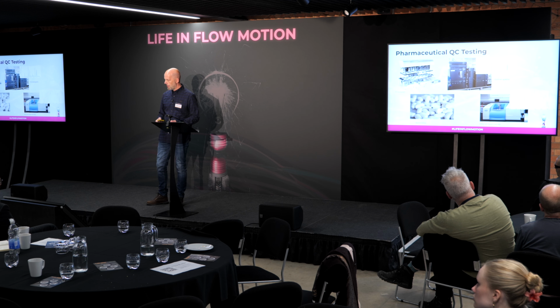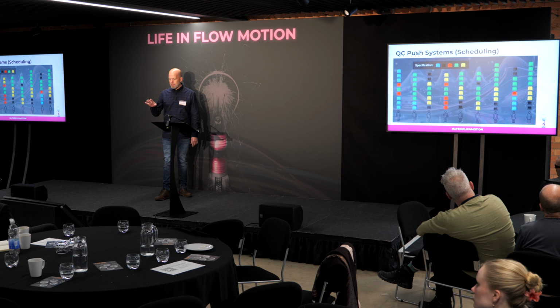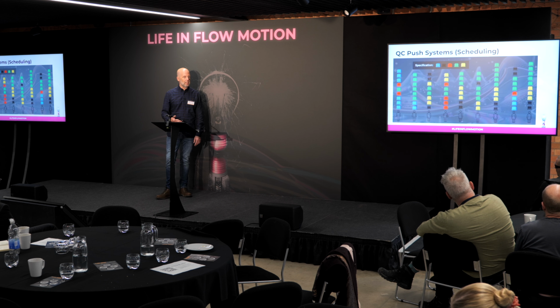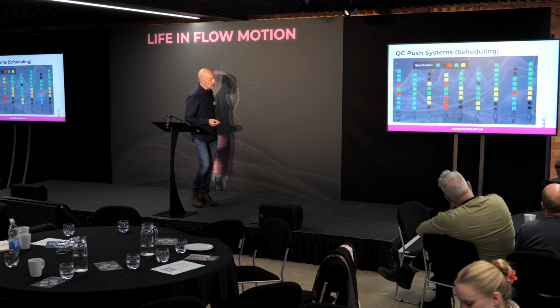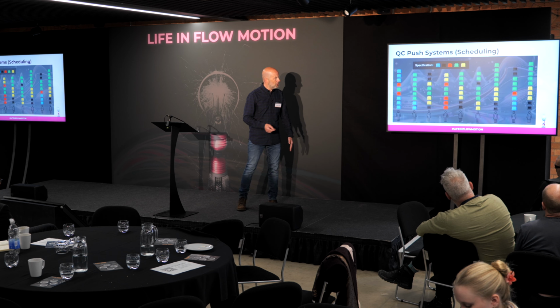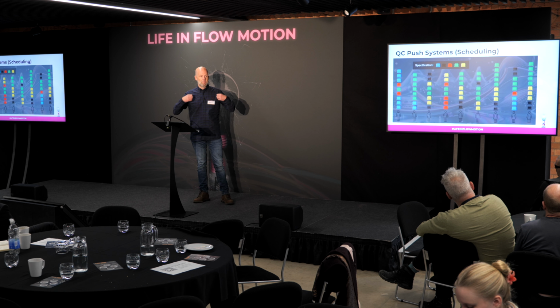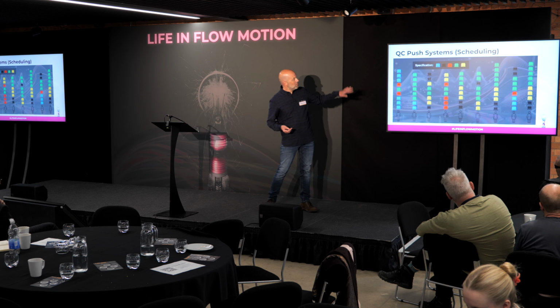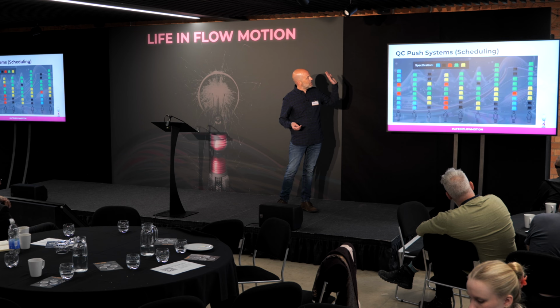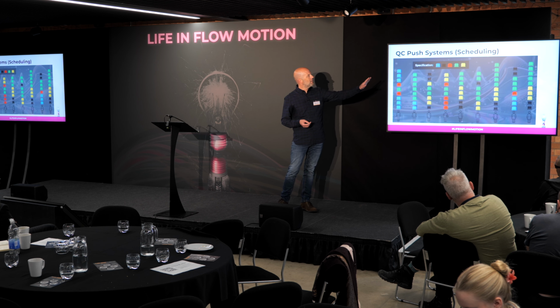So when you look at how QC work is organised, it's traditionally organised in a push system. You have a team of people, they range in competency, and you push the work in. You look at what their availability and give them the work. And you can see here, so this material here has a specification of 5 tests: blue, black, red, green and yellow.